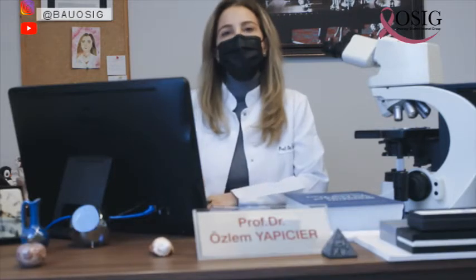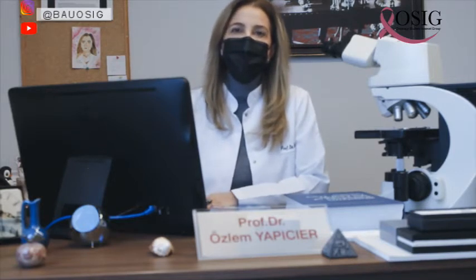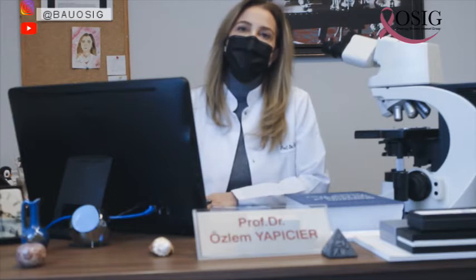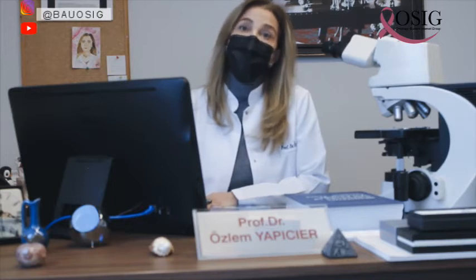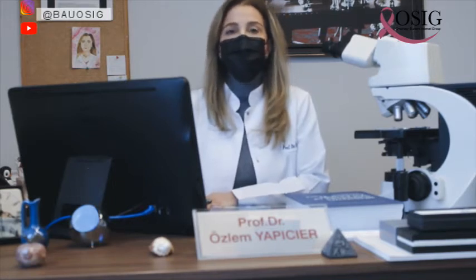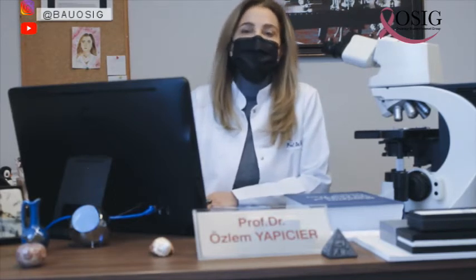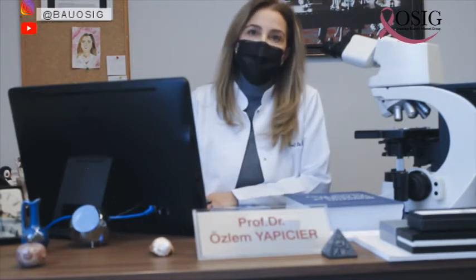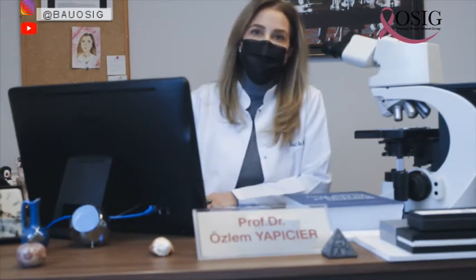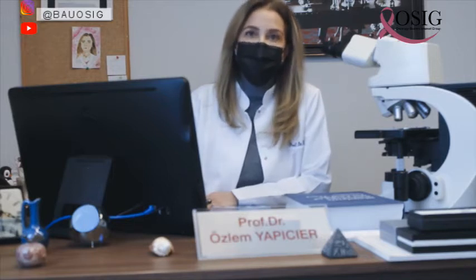These cells should be obtained from the external surface of the cervix, which is called the ectocervix, and also the endocervical canal, which shows the transformation zone. This is the area at greatest risk for neoplasia, and we have two methods. One of them is collecting cells by a brush and smearing the cells onto a glass slide. This is called the conventional method. The second method is called liquid-based cytology.